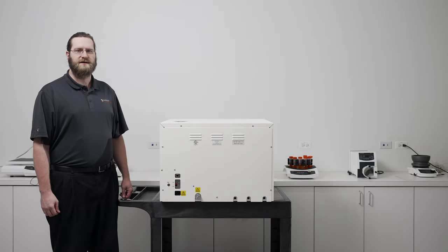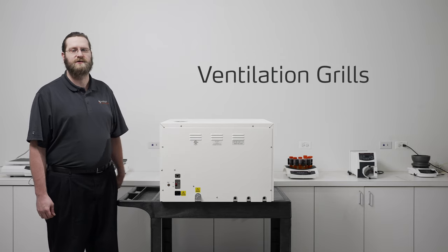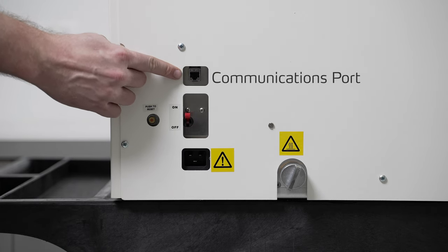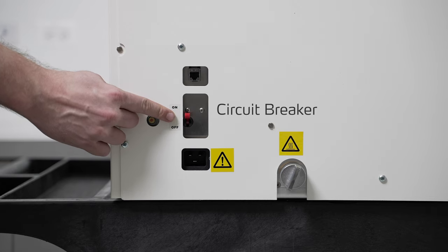Next I want to talk about some features on the rear of the unit, beginning with the ventilation grills allowing the unit to cool properly between cycles. Here at the lower left we start with the communications port for remote network monitoring of the autoclave. Below that is the circuit breaker for electrical protection.